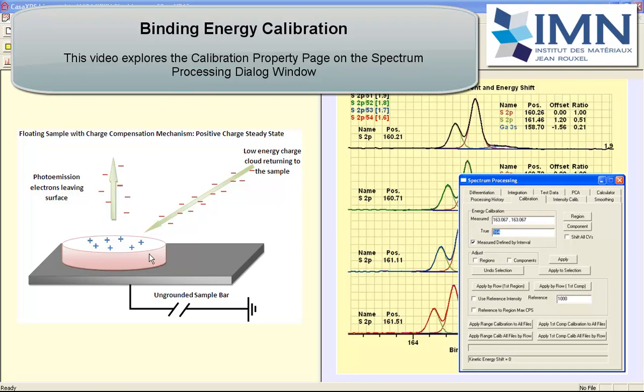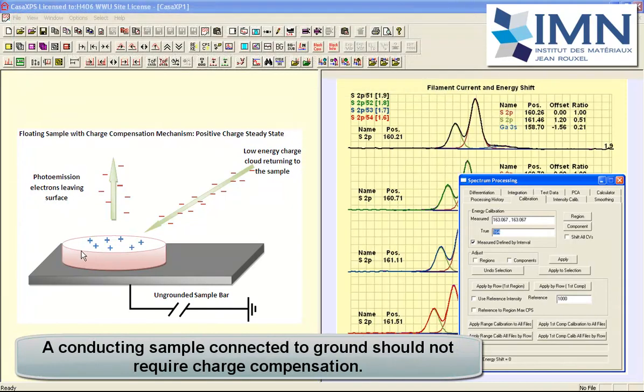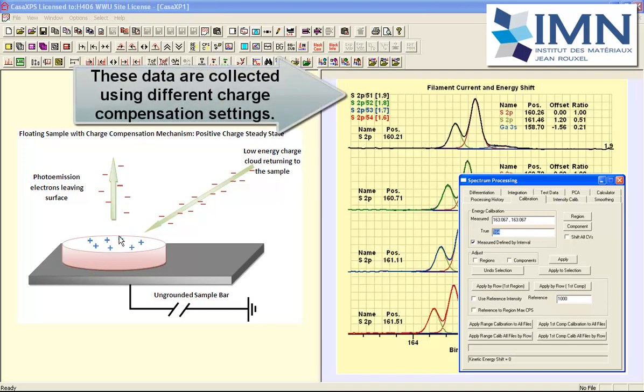The XPS of insulators represents a problem that must be solved in that electrons emitted from the surface represent negative charges. As a result of having an insulating material, a positive charge will build up on the surface and the positive charge attracts the electrons back towards the surface. This means that electrons would have a different kinetic energy depending on the charge that has accumulated on the surface.